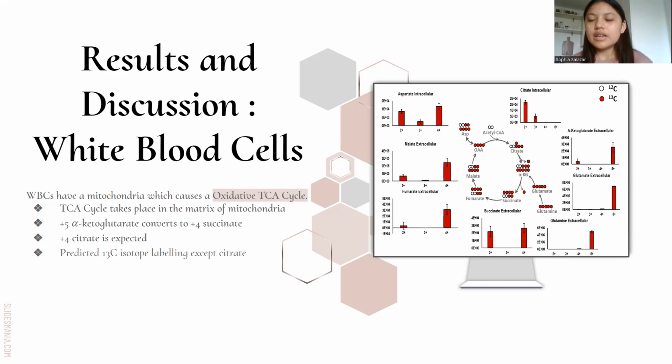The uniformly labeled carbon-13 glutamine is called +5 glutamine isotopomer, as it has 5 carbon-13 carbons, and this gives it 5 mass units heavier than the regular carbon-12 glutamine. Similarly, +1, +2, +3, +4, +5 isotopomer forms of any TCA metabolite indicate that these forms are 1, 2, 3, 4, 5 mass units heavier than the corresponding carbon-12 metabolite.